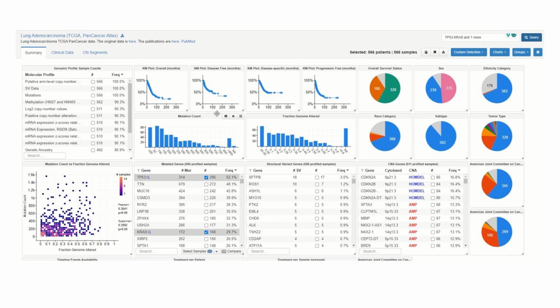We selected 3 genes for further analysis. We chose the first most frequently mutated gene, TP53, in lung adenocarcinoma, and 2 other genes which are well characterized and had either gain of function or loss of function mutations to show as examples. These other 2 genes were KRAS and KEAP1. Both have been described in previous studies of lung cancer.